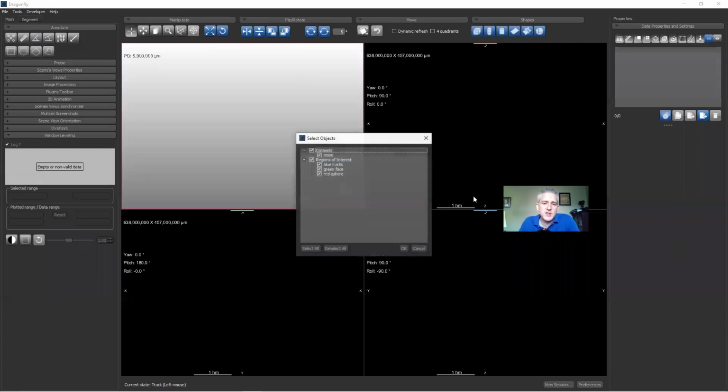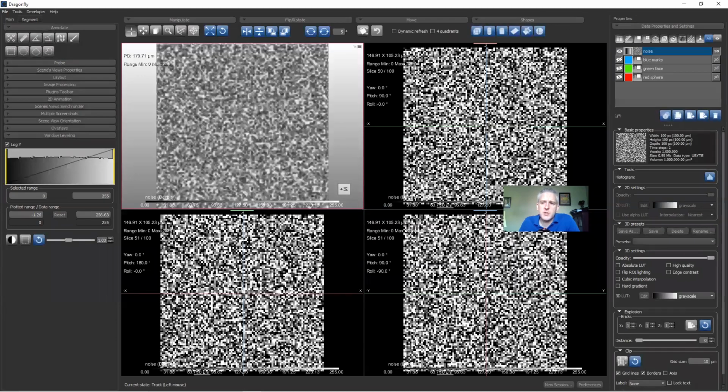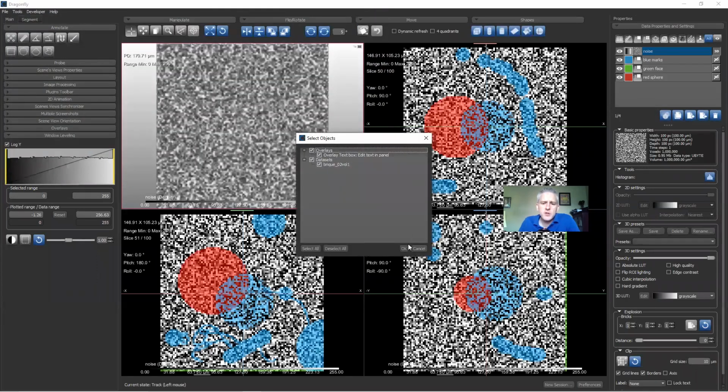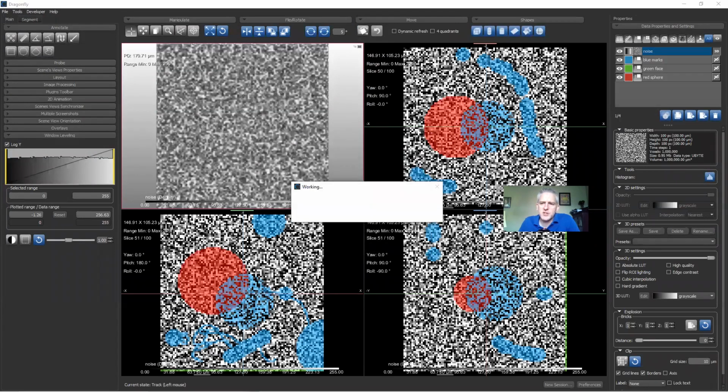This is the noise data that I'm talking about. So you'll see it's a 3D image channel of noise, and you'll also see it has 3 ROIs. And we'll see what those look like here in just a minute. Boom, boom, boom. Turn on the visibility. I'm also going to import the brick data set that I talked about. So I'm going to import both the overlay and the brick image channel itself.